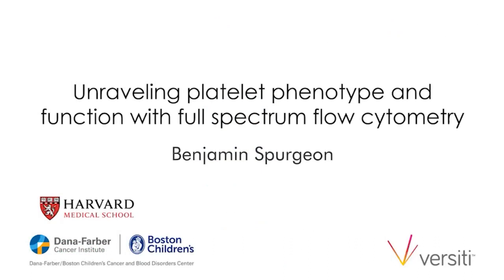Okay, so today's presentation is split into three parts. First, we'll provide some background on platelets and platelet phenotypes and functions. Next, we'll describe the optimization and development of a 16-color panel for analysis of platelet phenotypes and functions. And finally, we'll show some preliminary data that demonstrates successful application of the panel across different sample types.